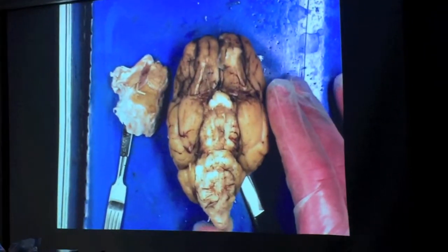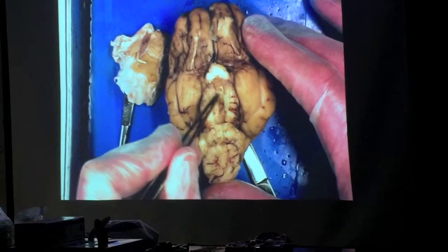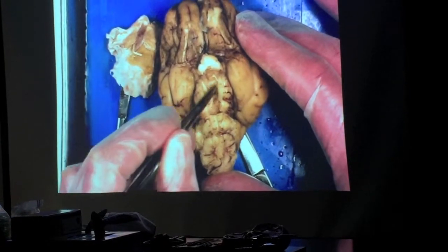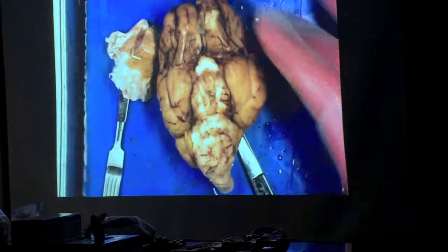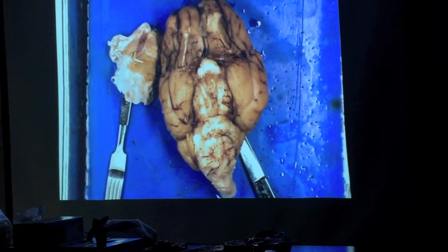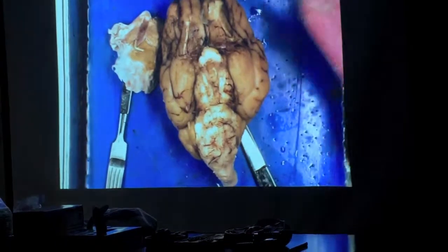The next item on the list is the mammillary body. That's going to be the area right around, clean it off a little bit better. That's going to be the sort of V-shaped area right around the infundibulum and right behind the optic chiasma. This involves a number of important reflexive behaviors that are controlled by the cells inside here. So things that you're not consciously aware of that happen automatically, the mammillary body does a bunch of those.